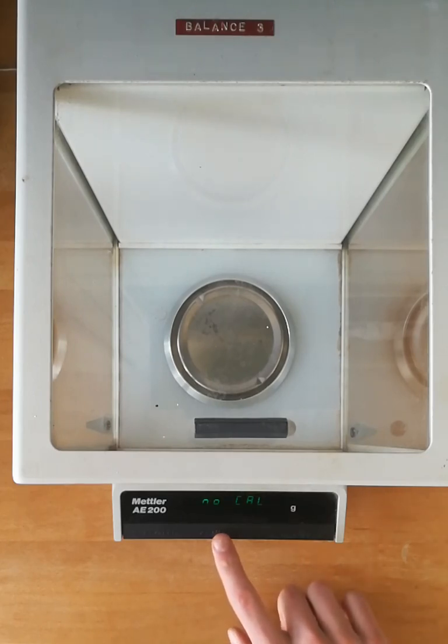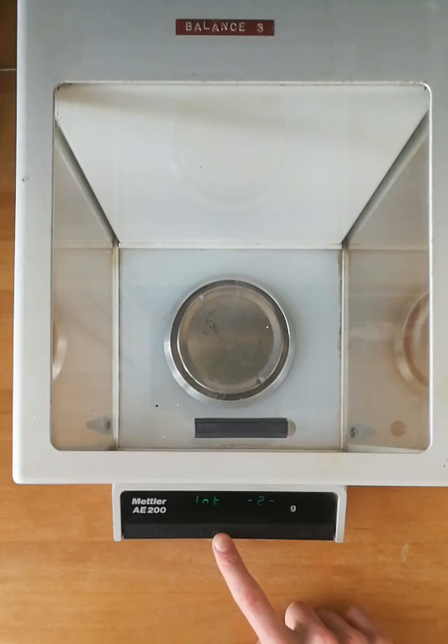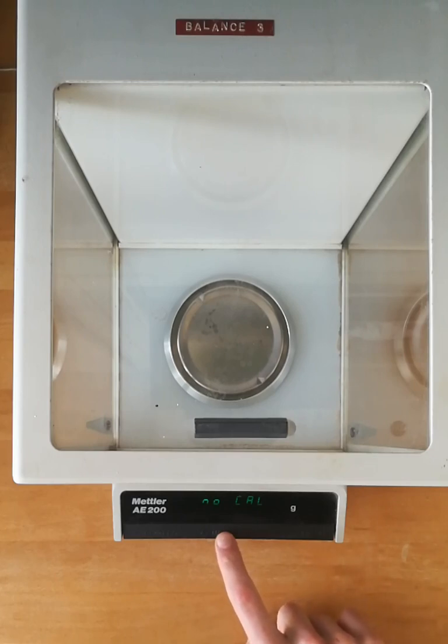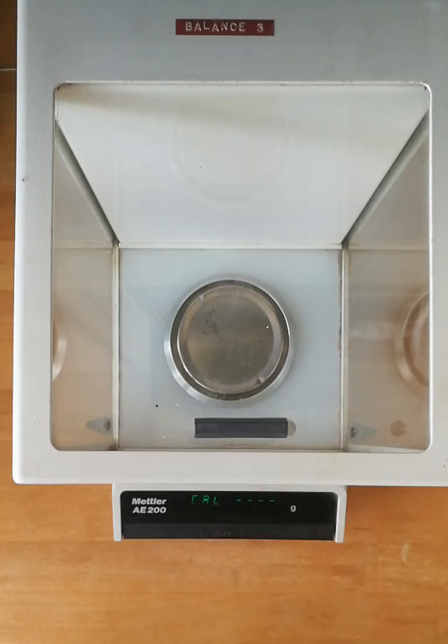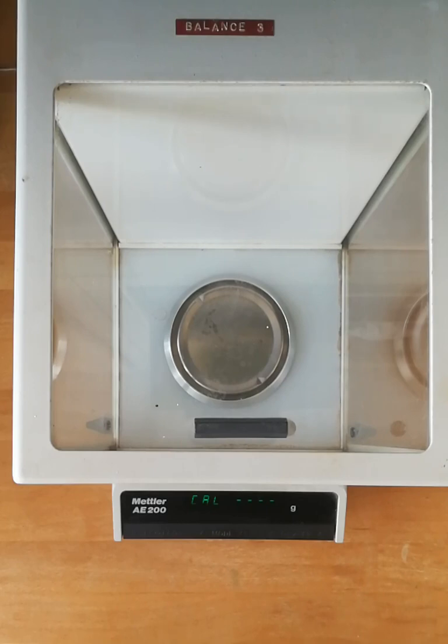I'm going to hold down the mode button until calibration comes up. This allows us to cycle through the different options that are available. Hold it down and then release when it says Cal. What it's now going to do is take an environmental reading before it starts, and that can take up to two to three minutes in some cases.